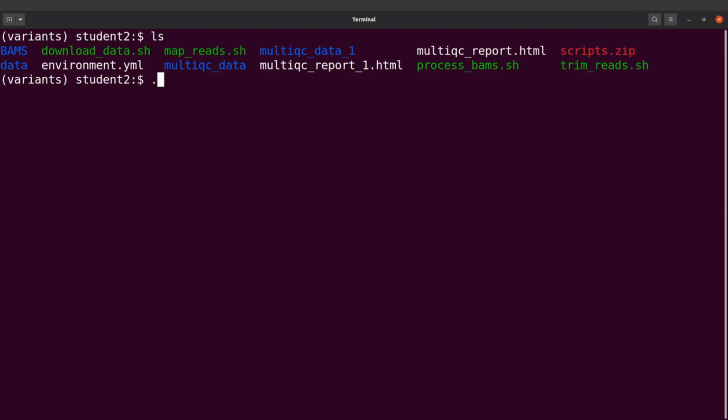So I'll say ./process_bams.sh and then I'll run it. And so the activities are going to be performed. This will take some time, so just wait and then later check the outputs.